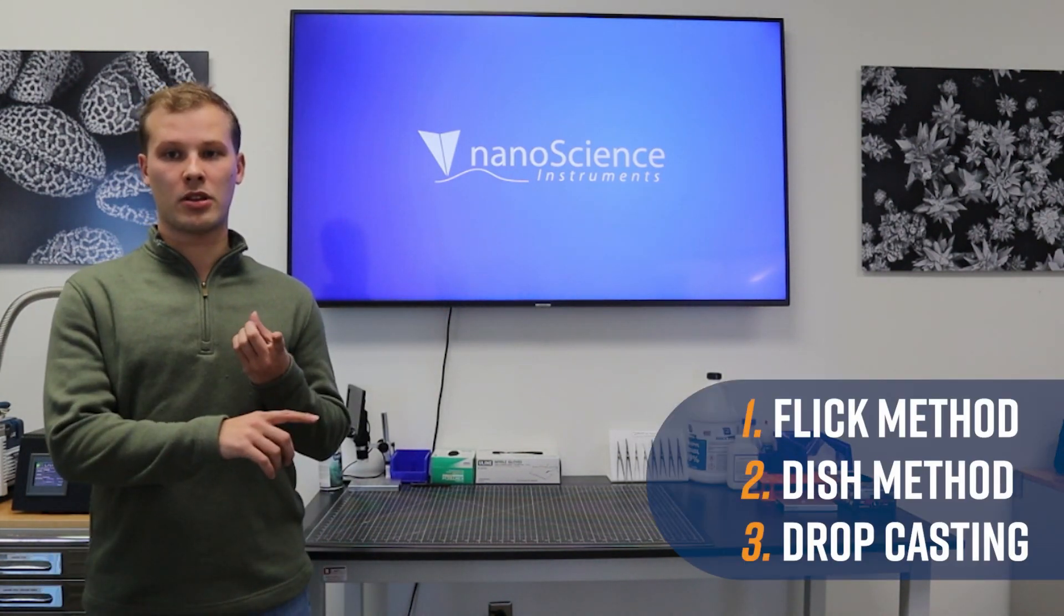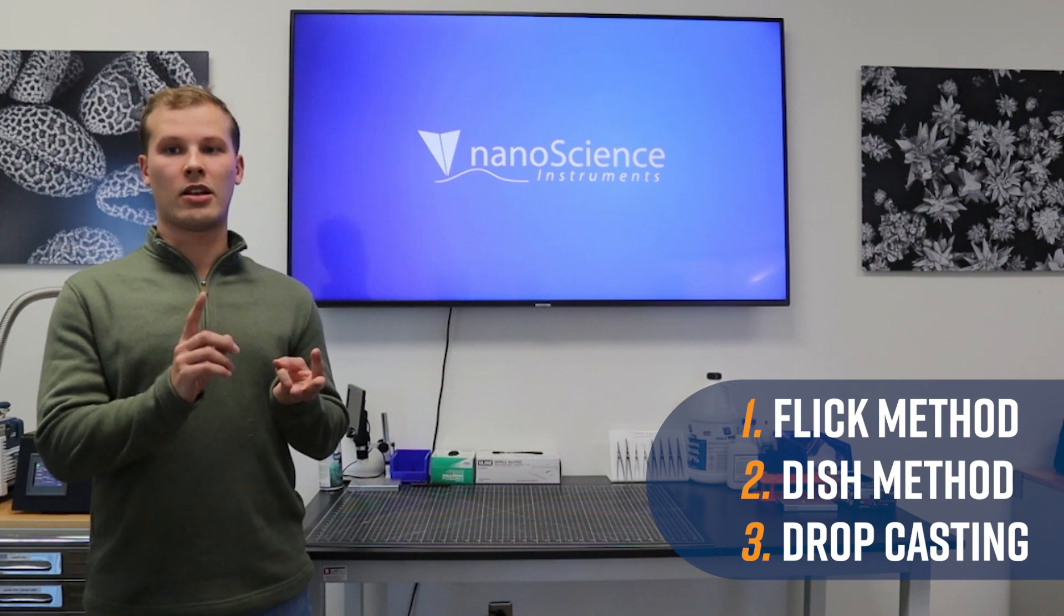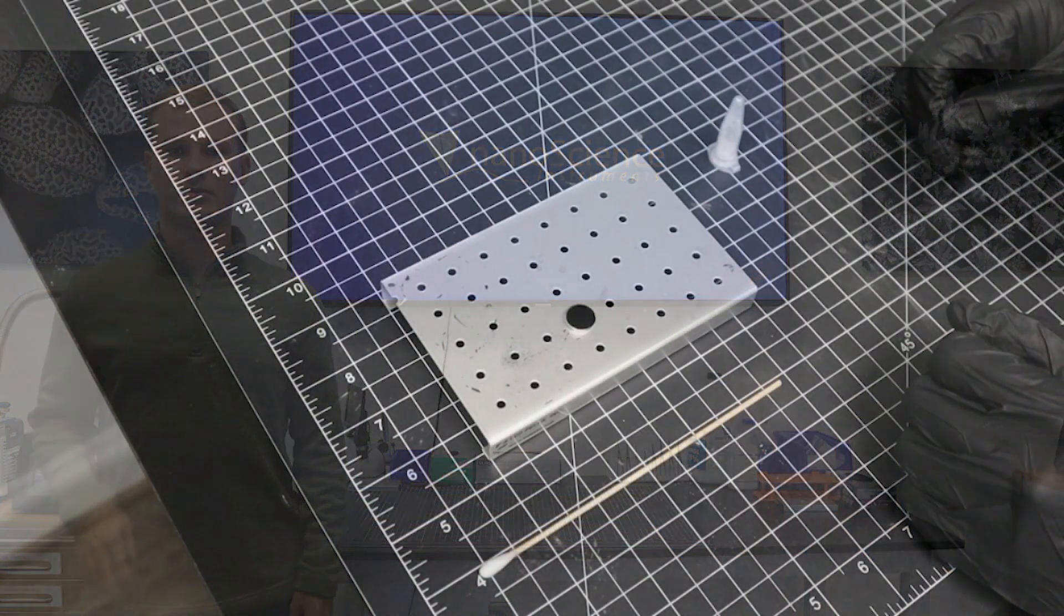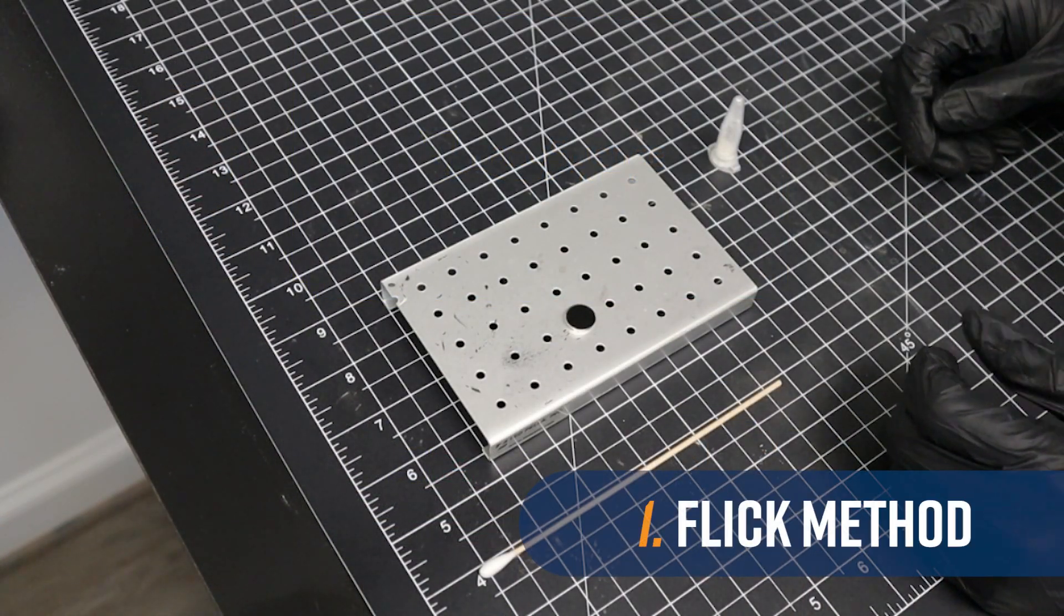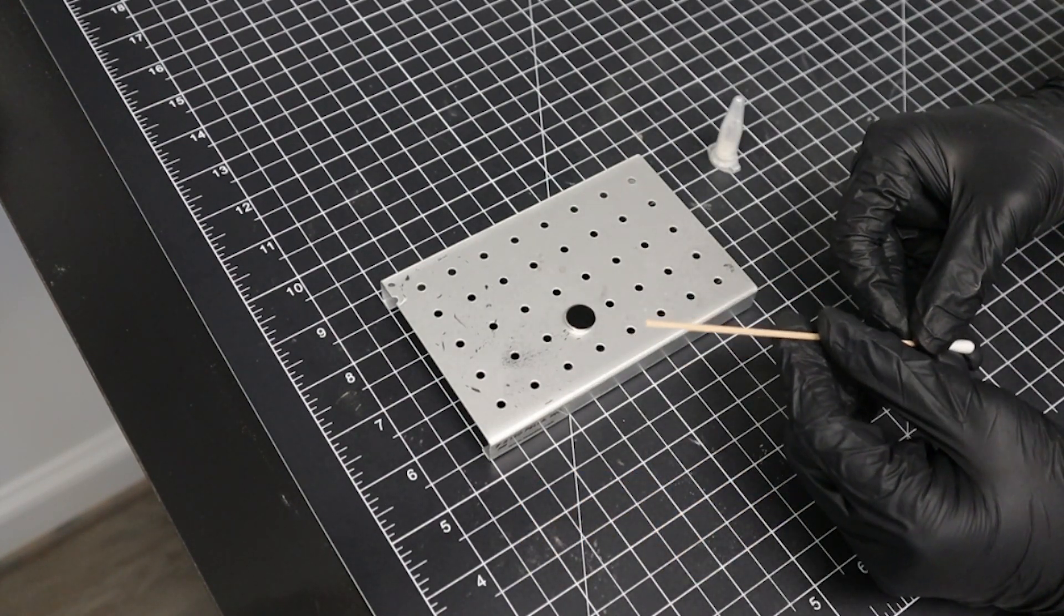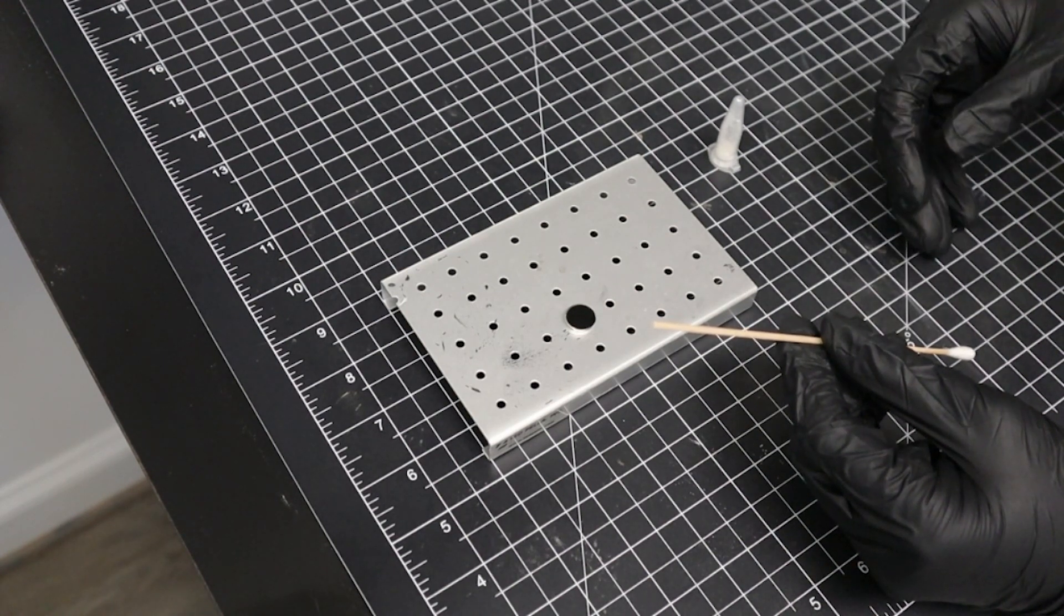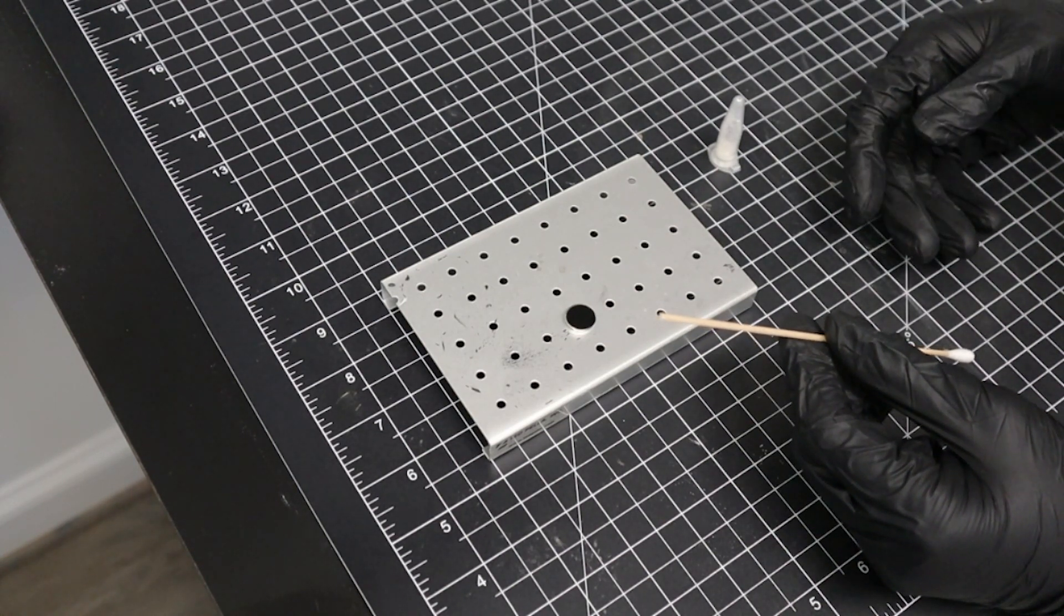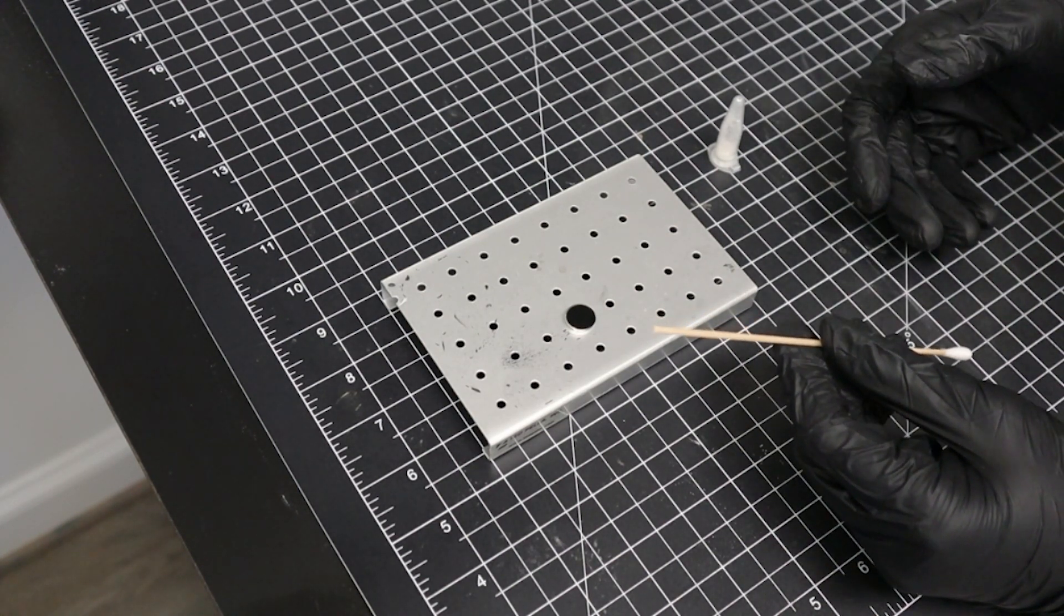These are the flick method, the dish method, and drop casting. The flick method utilizes a wooden cotton swab to disperse particles onto a sample stub. It is my preferred method, as it is both simple to execute and effective for any particles smaller than 500 microns.